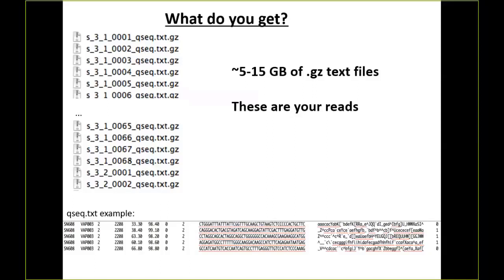I'm not super familiar with those, but I'd have to take a look at them. Actually, some of the stuff I'm going to teach you is how to look at FASTQ data. So you'll get an idea of what it looks like in FASTQ. You could probably find analogous information in the files you're talking about, in which case you should be able to figure out what's read one and what's read two in there. Yeah, the FASTQ will tell you if you're looking at paired end one or paired end two.